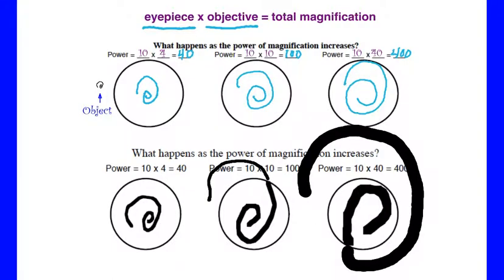So it's really important when you're working with the microscopes to find your object and focus it really good on low power. And you can even use the little pointer. It has a little pointer built into it. I'll just draw it on there kind of like that. You want to make sure that the very tip of the pointer is touching your object so that when you switch through the objective lenses, it will always be visible at some point in your field of view. Okay?